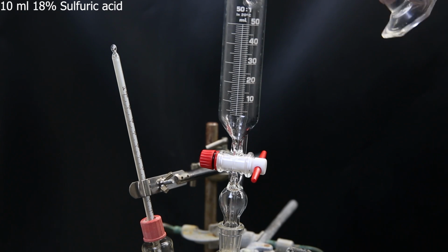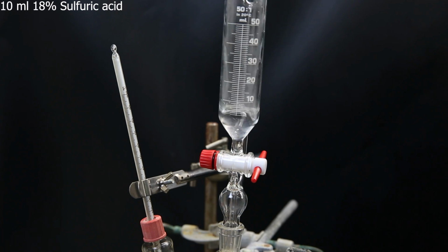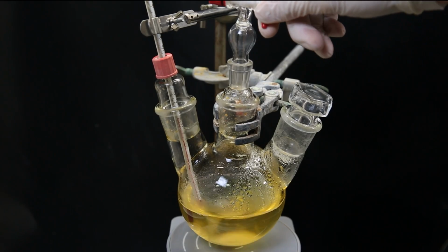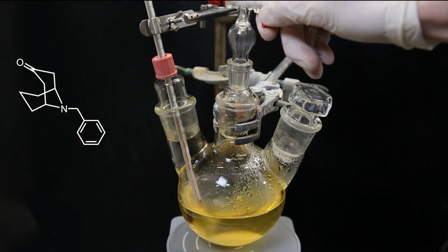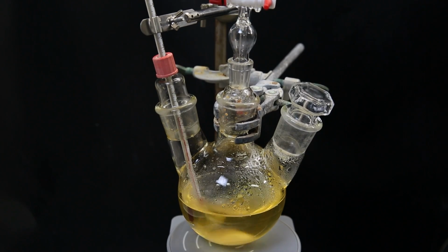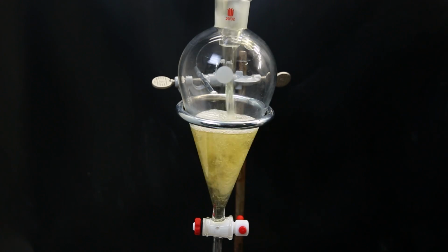So I add 10 ml of 18% sulfuric acid to the dropping funnel. I add it dropwise to adjust the pH of the solution to around 2. This will make sure that the amine of the product is protonated and stays in the water layer. When that is done, it looks the same, and I move it all to a separatory funnel.